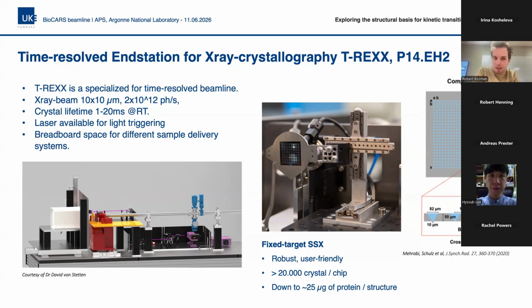And so it's a very robust system for us, and we really have minimal issues beamline-wise. I know if any of you have been to a FEL, you'll know the experience that it can take quite a long time to get everything just working. T-Rex really aims for simplicity to minimize that kind of overhead. And we're very lucky in our beamline scientist, David von Stetten, who is hugely helpful in performing these experiments.